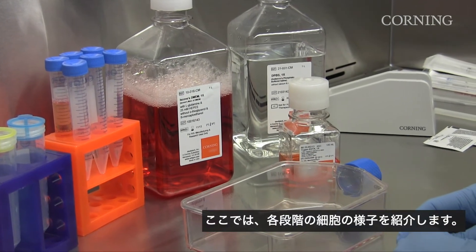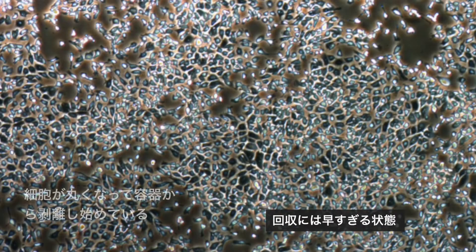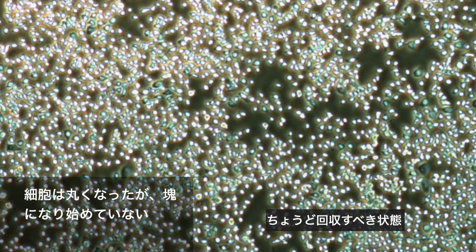Here are a couple of examples of what the cells will look like when they are not ready to harvest, ready to harvest, and over digested.